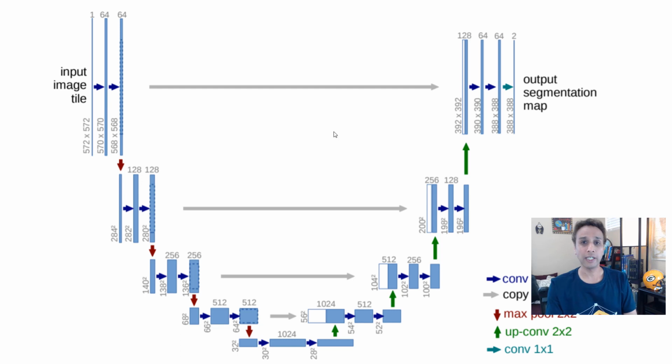And one other thing I'd like to mention is UNet is just the name of the architecture. You can actually change this many ways. Instead of using your own custom contraction path, you can, in theory, use something like VGG16 or MobileNet or any of the pre-trained architectures, and then instead of training that, use it as your encoder path and only define the decoder, right?